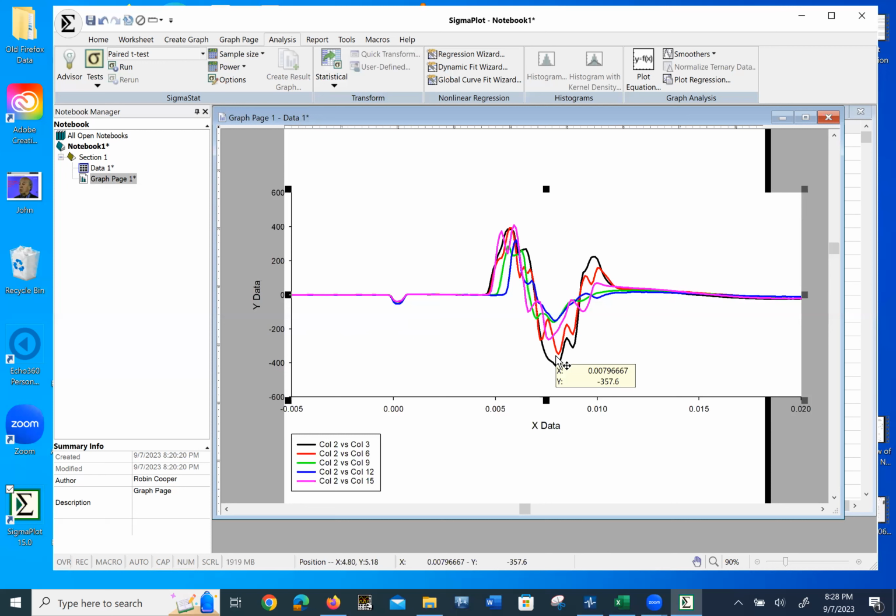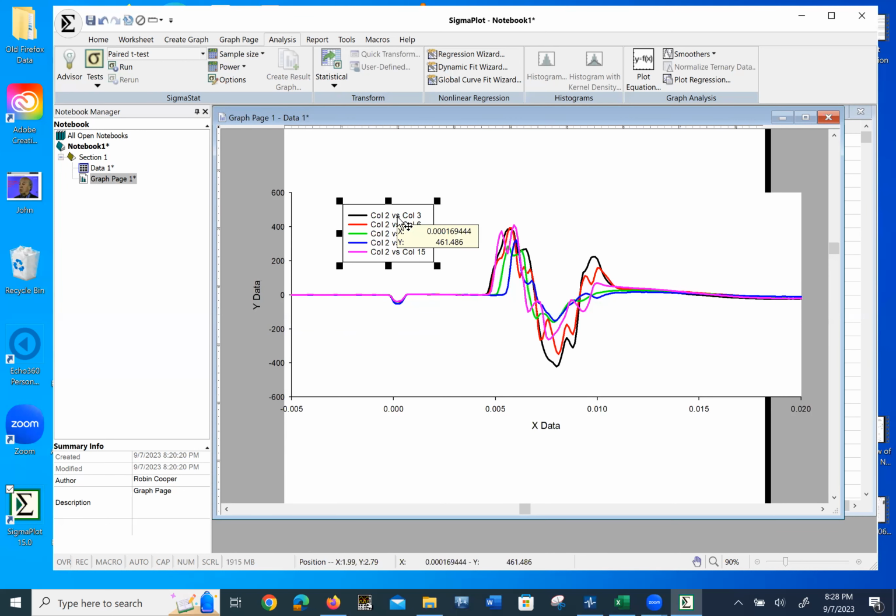So it's going back to the initial values. I mean, if we flushed longer, things like that, it might be pretty much close to the original black line. So now we can take this graph and superimpose it. You can take this and you can actually relabel these.